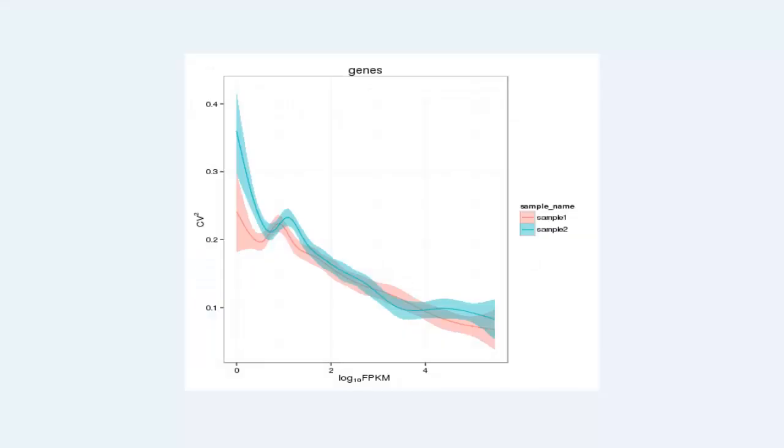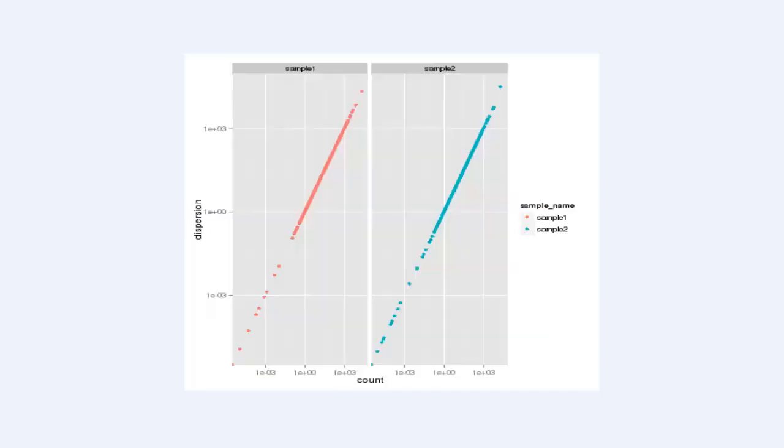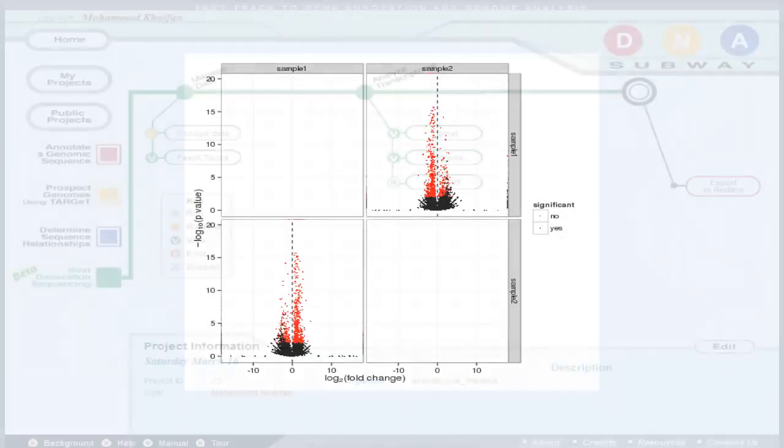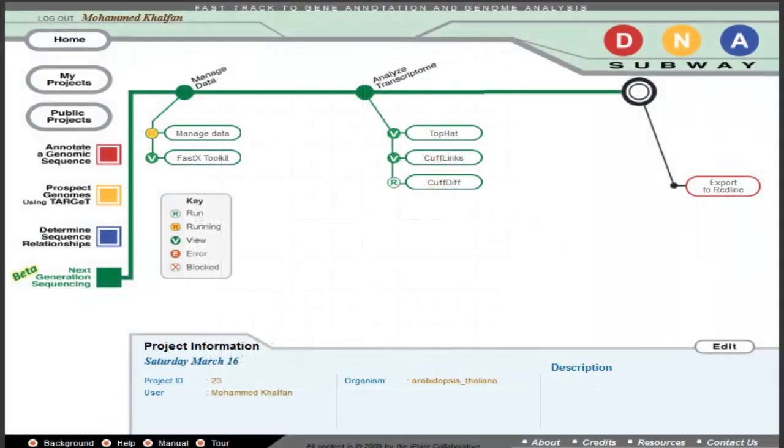At the CuffDiff stop, you'll see the results of your experiment in the form of various plots which detail differences in gene expression. Also available for download and analysis will be the actual files containing the list of genes, their expression, and other data.